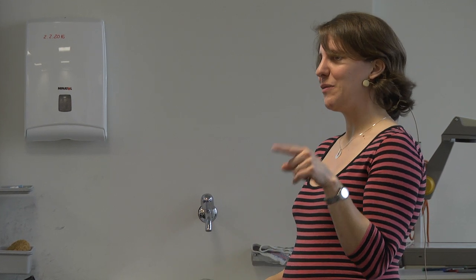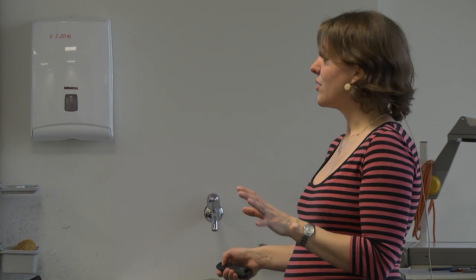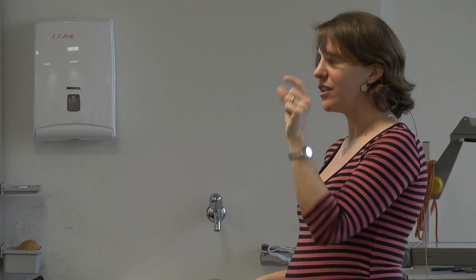But you will actually see when you come to SWATH analysis, where you work with much bigger isolation windows, this can become an issue. In SRM, this is completely fine. With SWATH MS, or when you do not isolate precursors with this 1 Dalton window, you must consider whether you can use B ions or not.